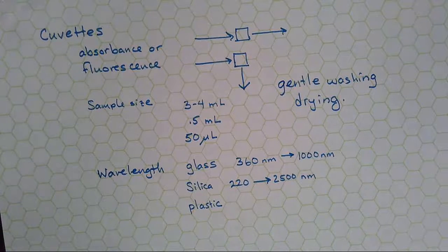That's all I got on cuvettes. How would you dry it? Well, when you were in organic chemistry, how did you dry things? With air. Okay. If you don't get too aggressive with the air, that can work. Acetone does a great job.